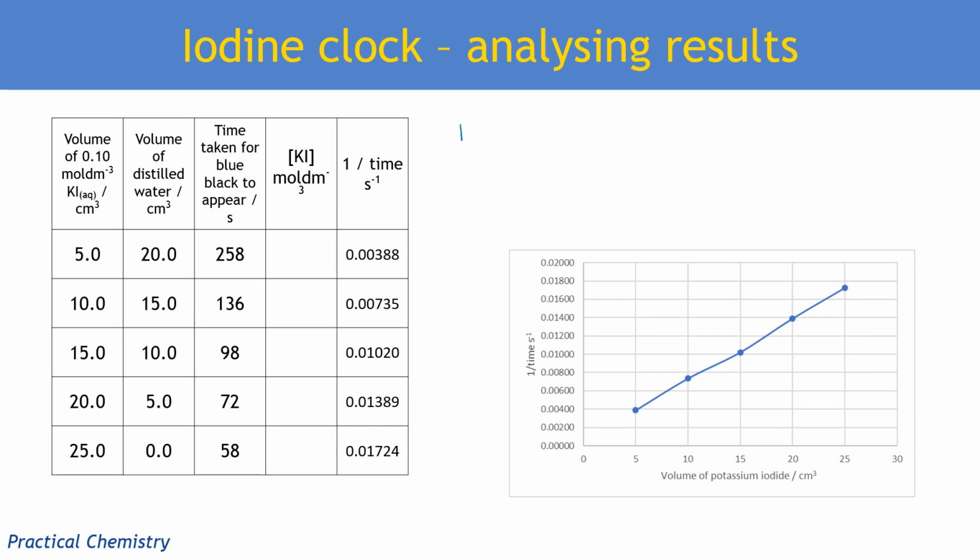And our final concentration in a mixture, and this is so helpful in many different areas of chemistry, is equal to our initial concentration, like of the stock solution that we're adding, times by the initial volume, like the volume that we're going to add, and then divided by the total volume. That includes all the other things that we added to that reaction mixture, so the peroxide, the water, all the different things. I've forgotten what else was in there, the acid.